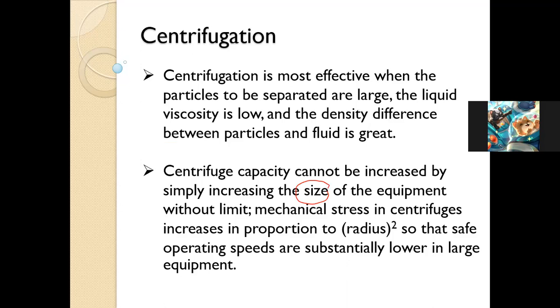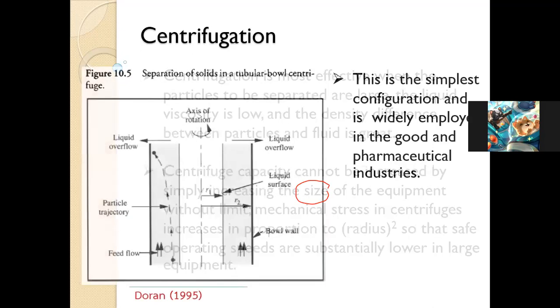This is very important. When you scale up the centrifuge and the size is increased, the speed of the centrifuge should be lower than for the small size. This is the most common rule for scale-up.